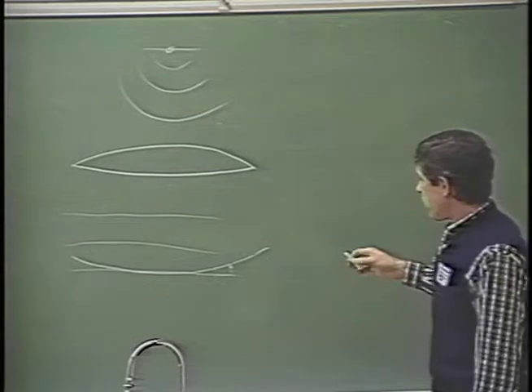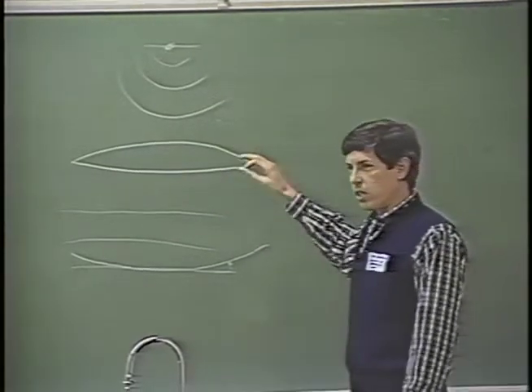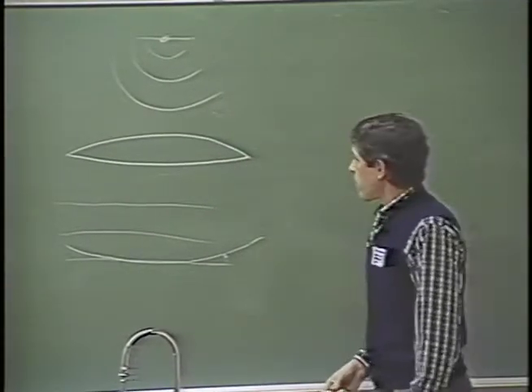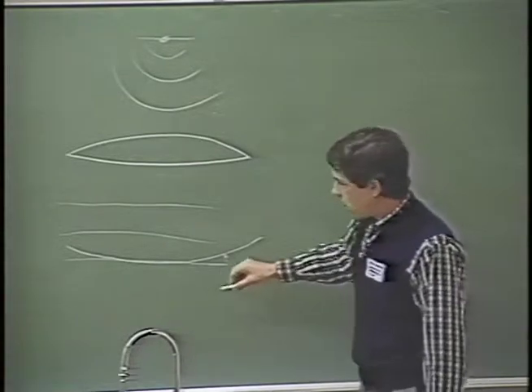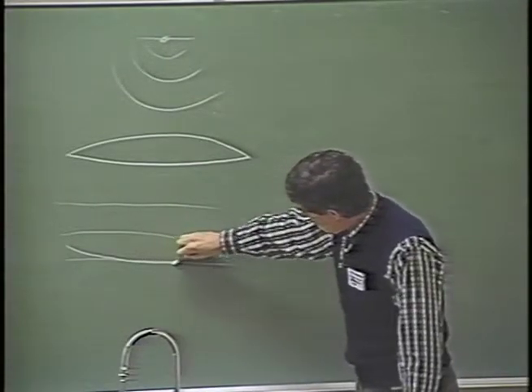Now, the other thing about the objective lens is that it's really a crummy lens in comparison with an optical lens, at least in the amount of spherical aberration that it produces. Now, the spherical aberration you can look at as producing a phase shift that actually I could draw like this.